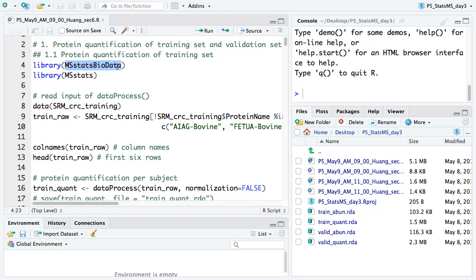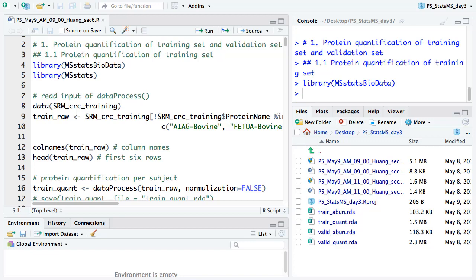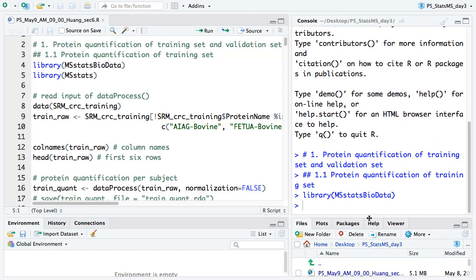We need to load the MSStatsBioData package and then load the pre-processed peak intensity data for colorectal cancer. If you don't have the MSStatsBioData package, open your browser and search for 'Bioconductor MSStatsBioData.' The first link is the package page. You can copy the install code from there and run it in RStudio. If you have a problem with the package, please put the pink note up.